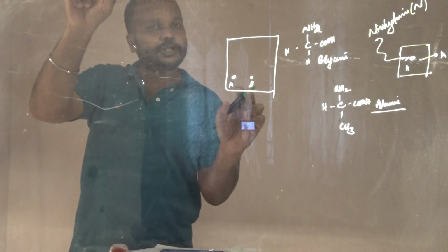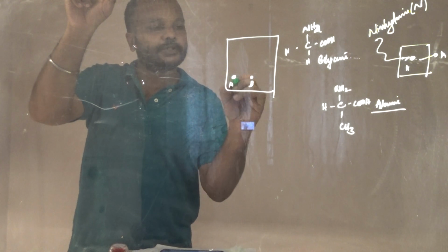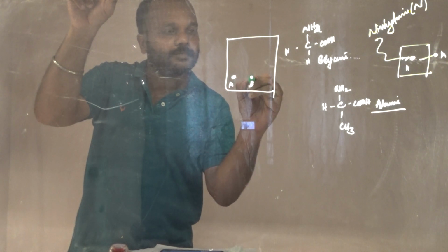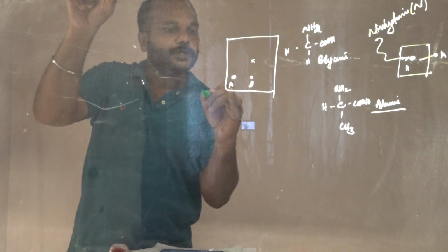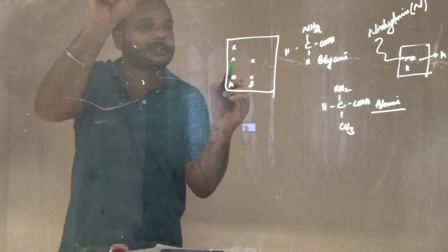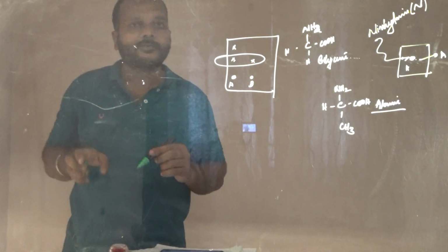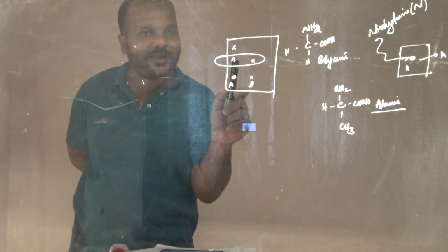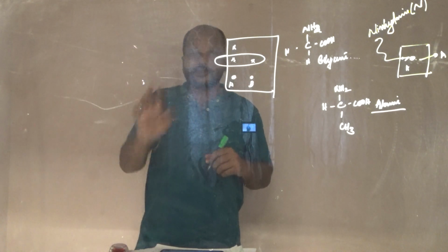B mixture contains 1 amino acid. So when we check it, suppose the same amino acid in B is present in A, we can easily tell that. After the chromatography, we identify the spots. Here A has 1 spot, and the next spot here. In this case, the distance traveled by the component in A is similar to B. Obviously, this is the same amino acid which is present in A also. The component remains the same.